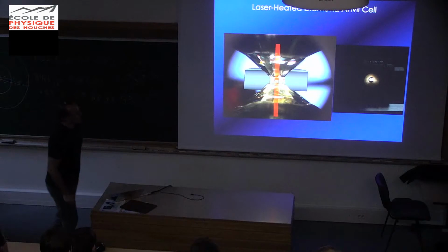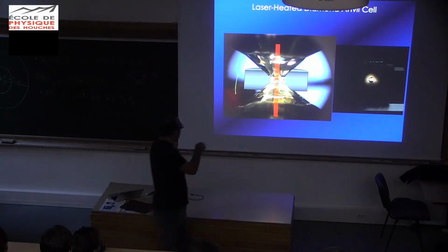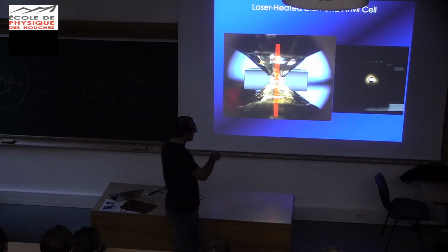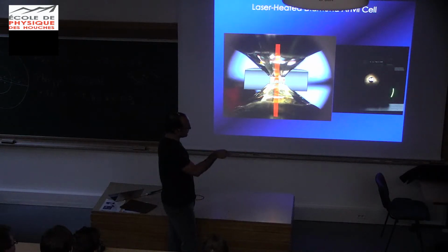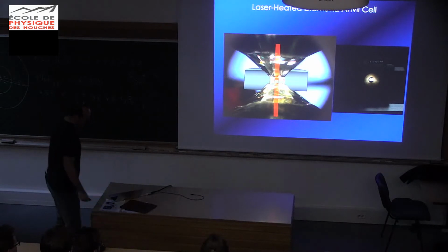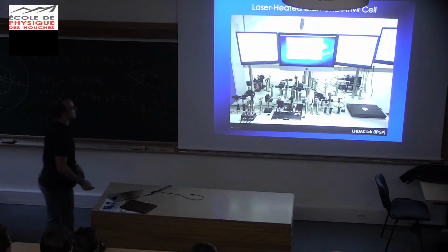So here's a picture taken in my lab where you're actually looking through this hole here. You know, zoom out, and this is just taken with my phone. The only source of light is that little piece of sample which is being heated up on a 20 micron spot, and it's filling out partially the whole room. But you can see a lot of light coming out through it, okay? So this is how much light you put in the system. This is what the system looks like.